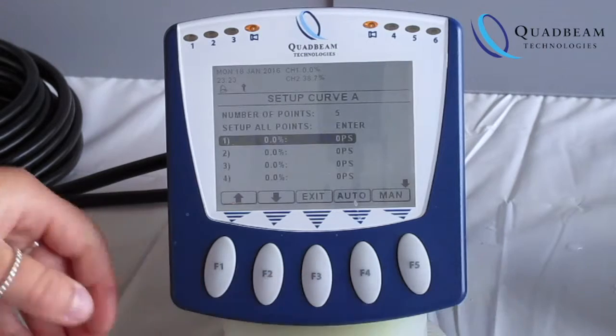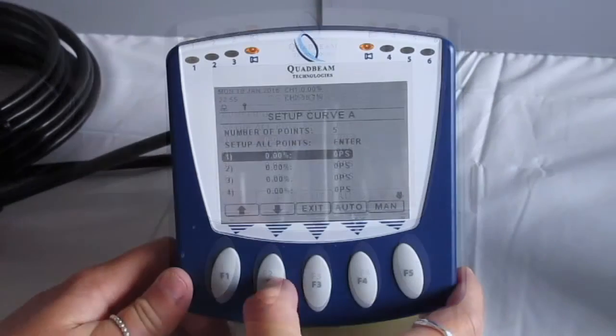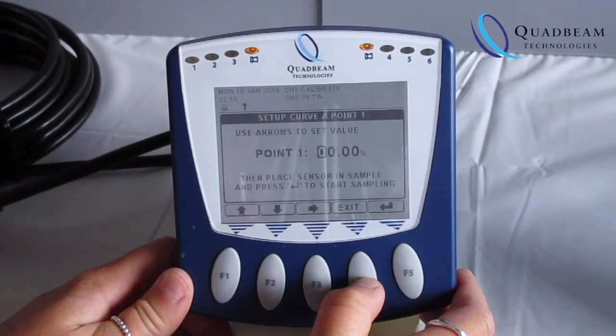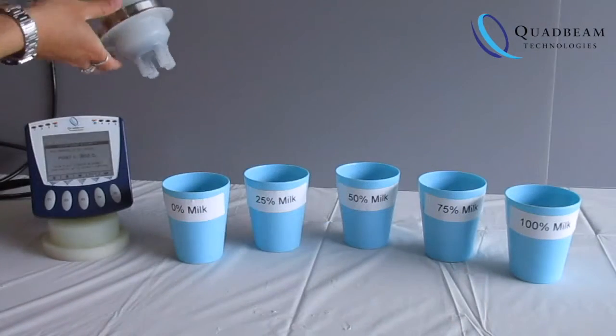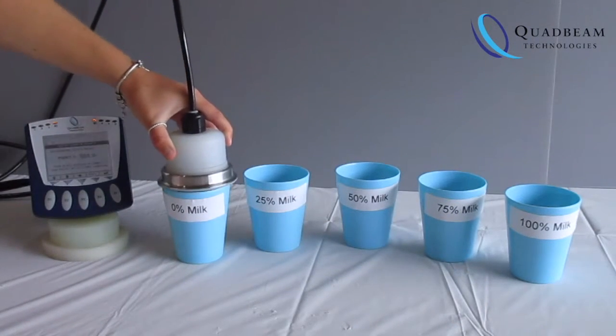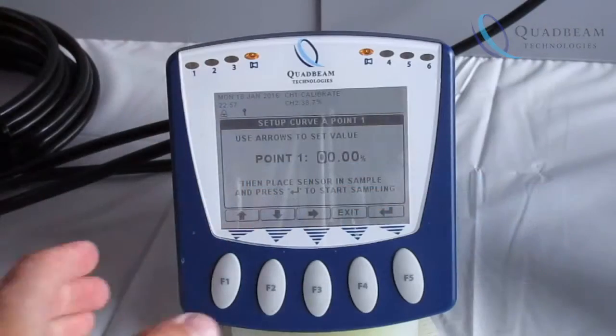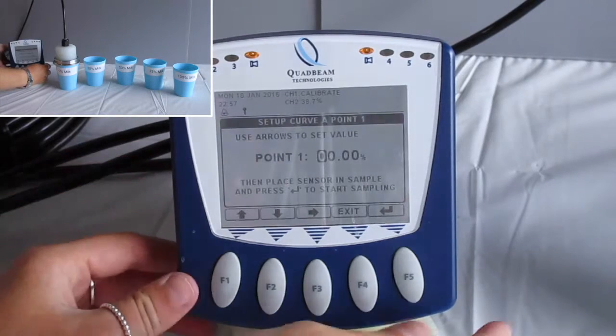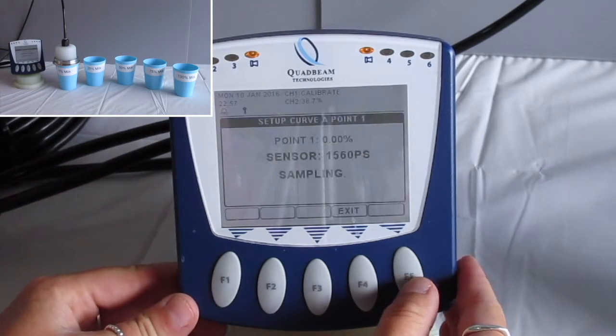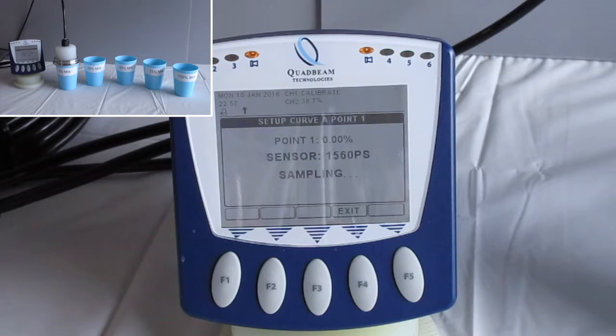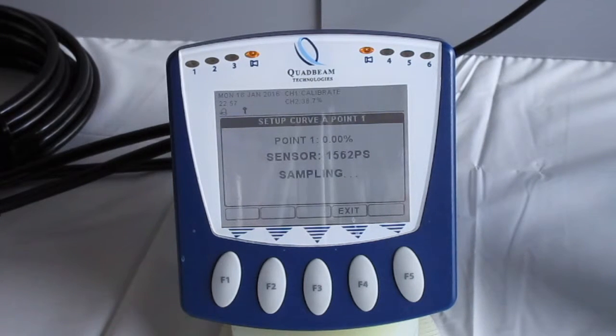Then move to the first point. Input the percentage value, being 0% in this case, just straight water. Place the sensor ensuring that it's as centered as possible to get the reflectivity as equal as possible, then push enter. You'll see that the probe signal value is being detected and sampled, and then once that is complete it will apply a probe signal value to the actual percentage.